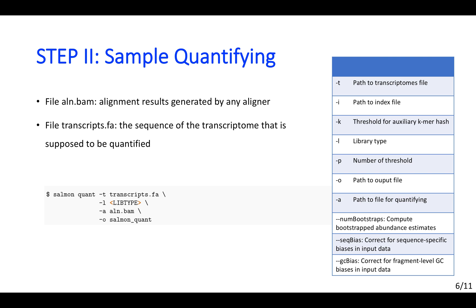The next step is sample quantifying. This could be performed with the salmon quant command. Generally, two types of files are needed here. The first one is the alignment results generated by any aligner you like. The second one is the sequence of the transcriptome that is supposed to be quantified.